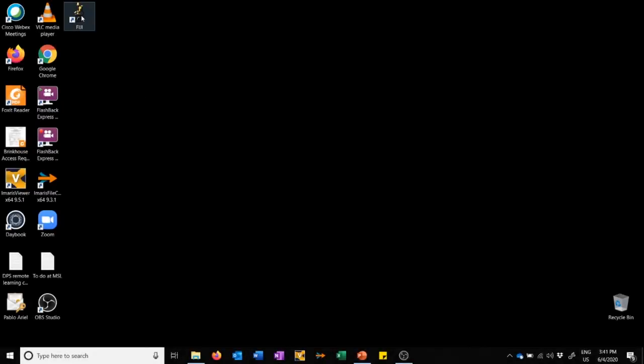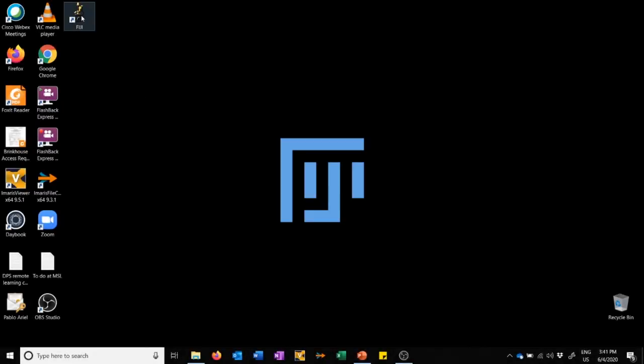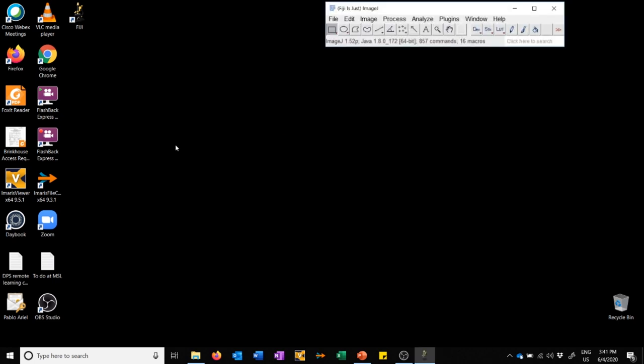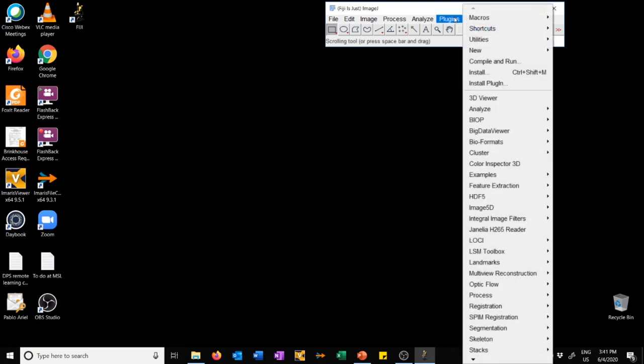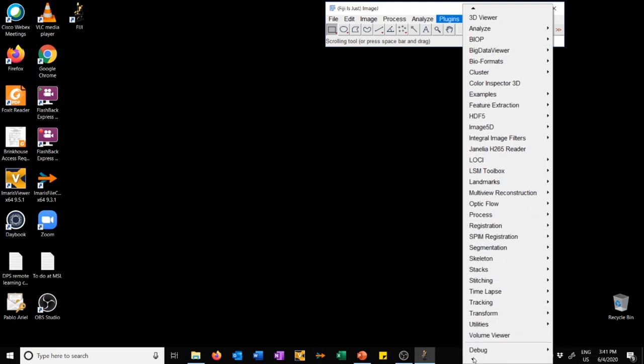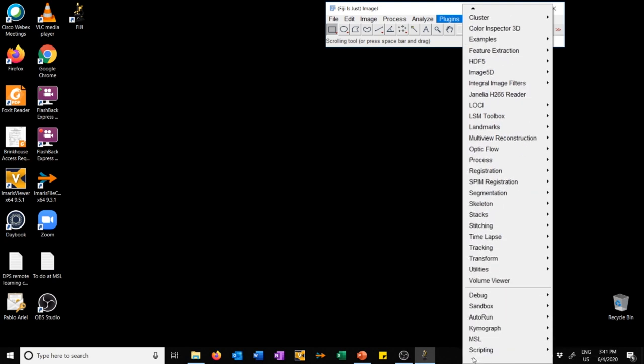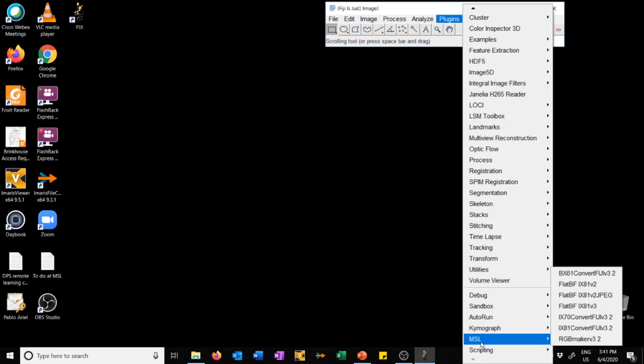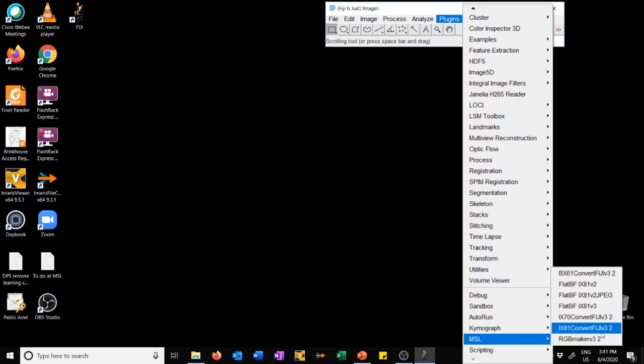I'm going to open Fiji. I have already installed the plugins I mentioned. I put them in a subfolder of the plugins menu, which you can see down here, which I called MSL. The two plugins we'll need are BX61 Convert Fiji and RGB Maker. If we were using data from the IX81, we would need the IX81 Convert Fiji. The particular dataset I'm going to use was acquired on the BX61, so that's the first macro we're going to use now.